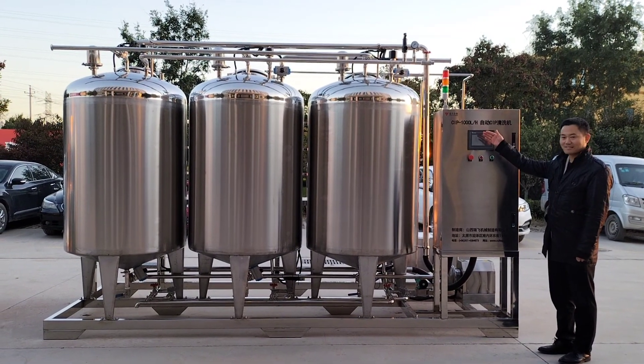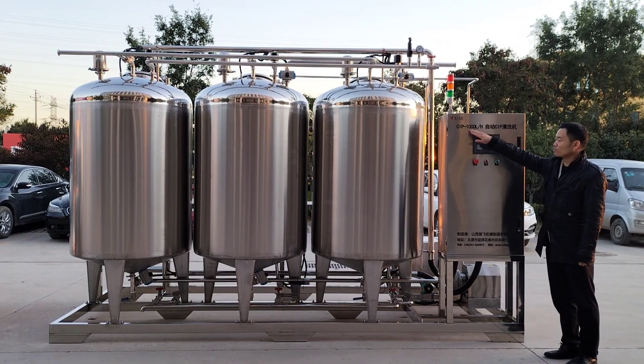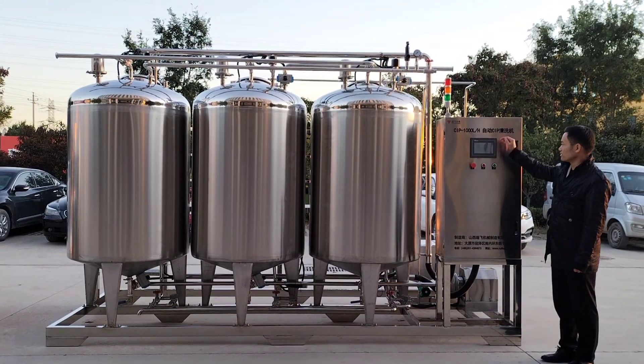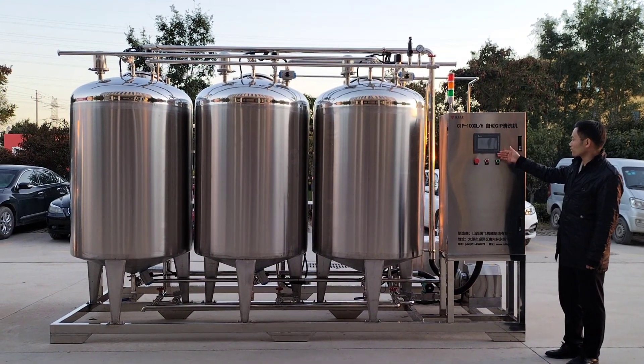This is an automatic CIP cleaning machine. Capacity is 1,000 liters per hour, and it is controlled by the PLC and touch screen.